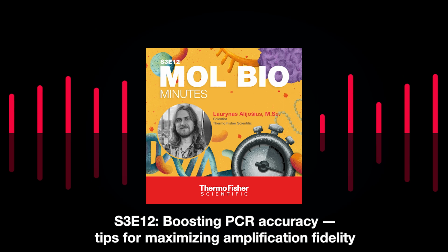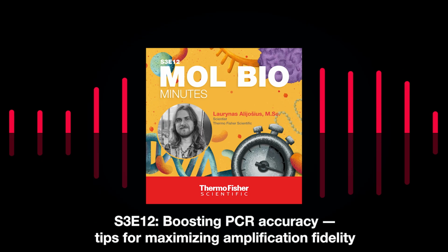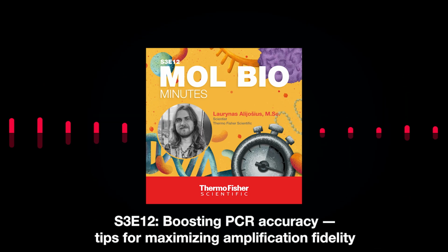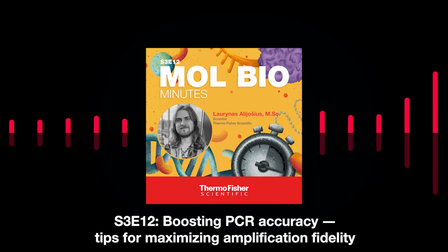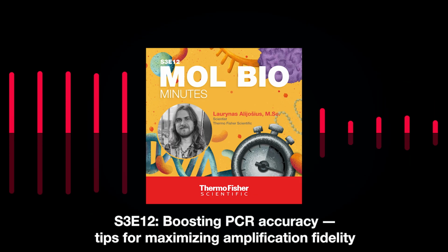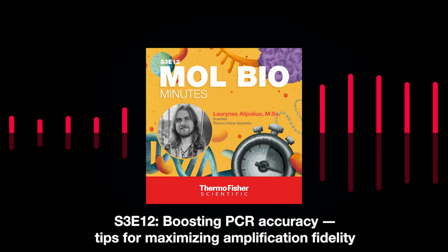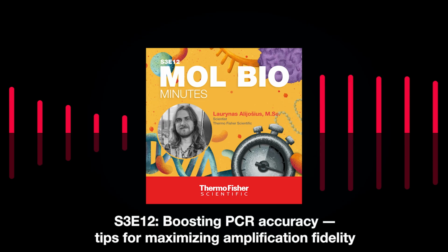And of course, you will save more of your precious time. So, remember the story I told you at the beginning. If I had used accurate PCR back then, I would have saved myself so much time and frustration. It would have been so much easier, honestly. Now we know why it's nice to have good PCR, right?